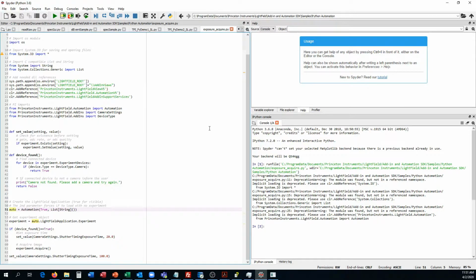What you want to do is run the script, create the connection, but then when you want to debug or add into that, you're going to want to step through. So to execute this command, you're not going to run the entire script again. You're just going to run this line. So I'm going to select this line. I'm going to press F9 to run the line.